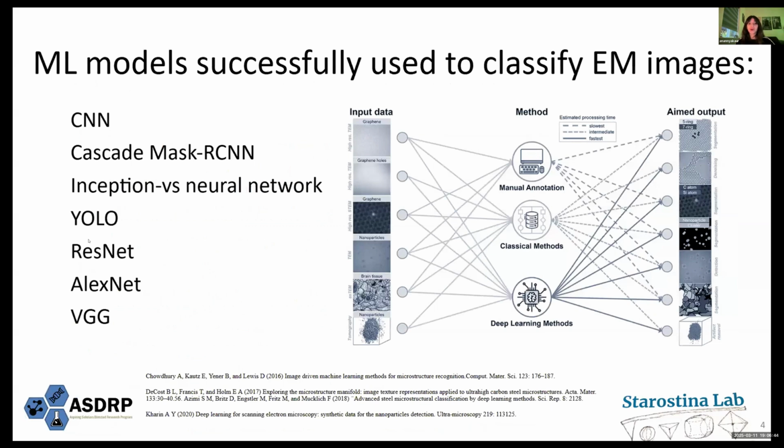So now the different models that are used to classify the images. First off, we have convolutional neural networks, which also include AlexNet and Visual Geometry Group networks. These are deep learning models that are used for image recognition, detecting different patterns like edges and textures. AlexNet was one of the first successful models. And then the Visual Geometry Group network is really simple and effective, and it's great for transfer learning. But overall, all of these require a lot of memory and computing power, so that could be a challenge.